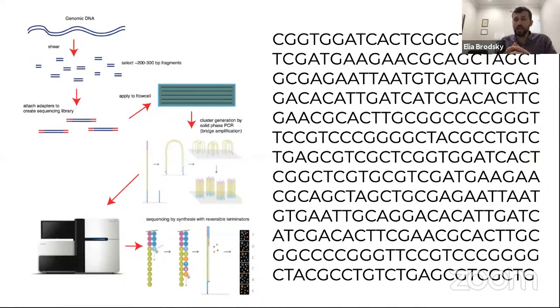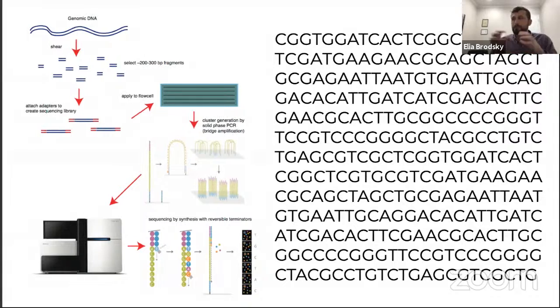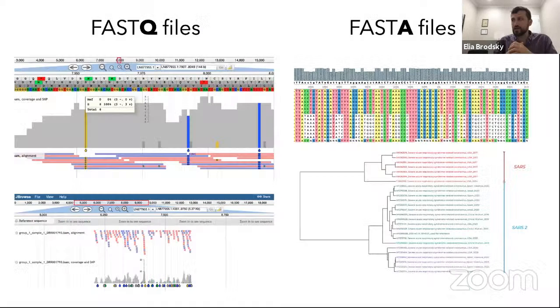If we have a long sequence, the sequence is already assembled. For example, we're looking at a particular pathogen and using Sanger sequencing. The challenge is then to align to other sequences and try to find variation. So here are the two main approaches to analysis for these types of data sets.